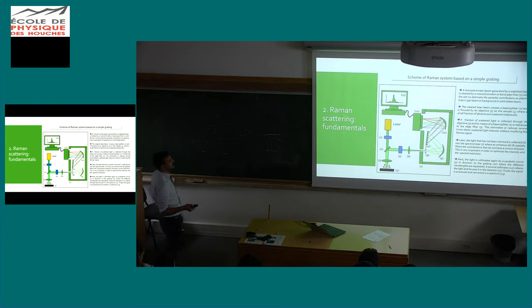It's relatively similar to the PL setup, but you need really very high quality optical components and also very good monochromators. Normally, for example, in IREC we build our Ramans with triple monochromators in order to have high resolution Raman. This means we don't have just one monochromator. We have 3 monochromators together, and then you have a really very high resolution.